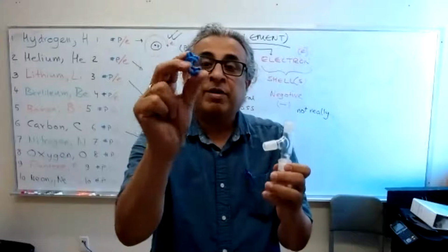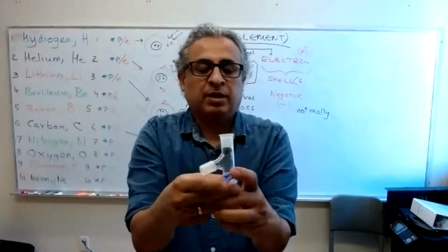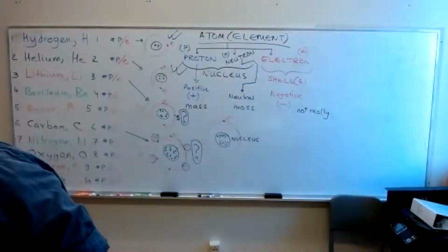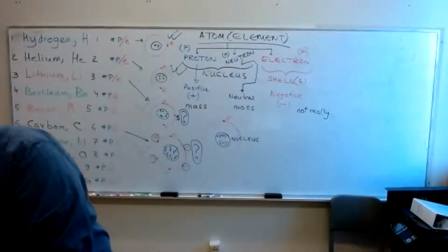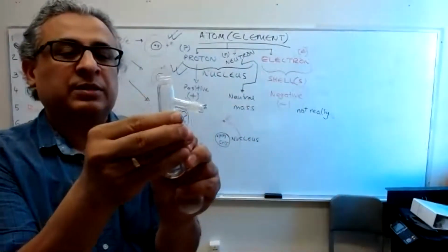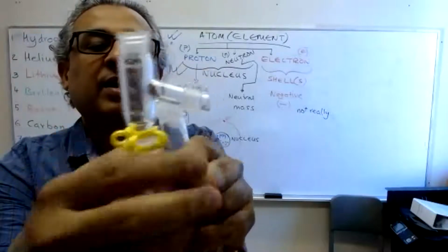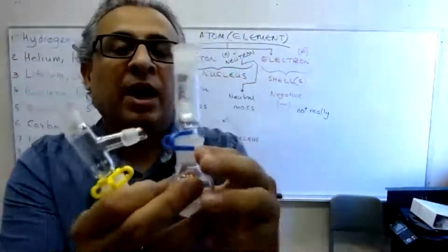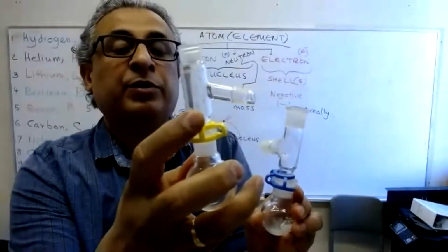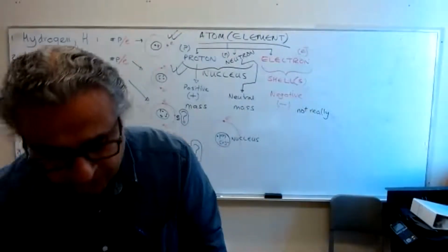So there are different clamps for different size joints. The blue clamps are for 1922s. The yellow clamps are for the smaller joints. This guy says 1410. This guy says 1922. And you use a blue clamp for the 1922 and a yellow clamp for the 1410 or 1420. You can think about what they mean, okay? I'm not going to discuss it right now.